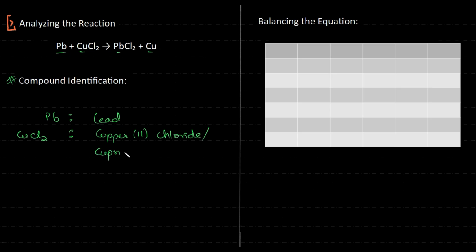We have another name for this actually. This is your cupric chloride. Then we have your lead chloride, and then you have your copper.